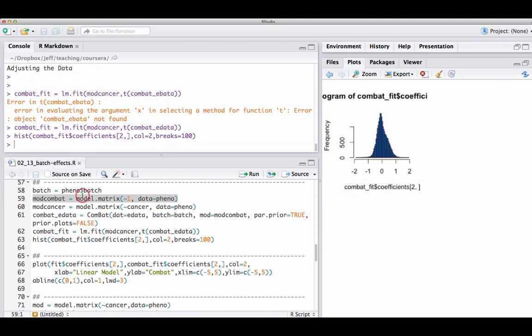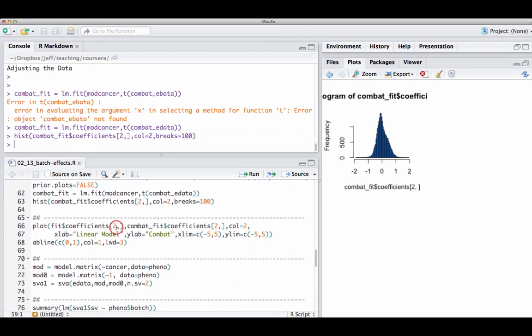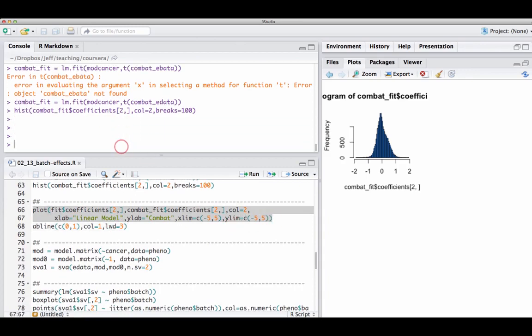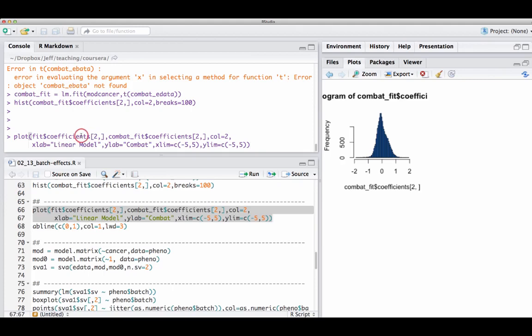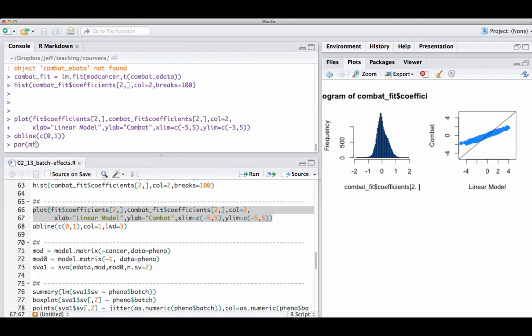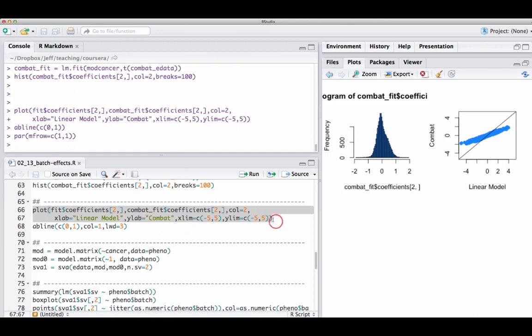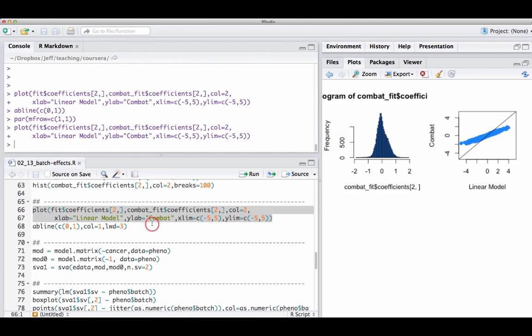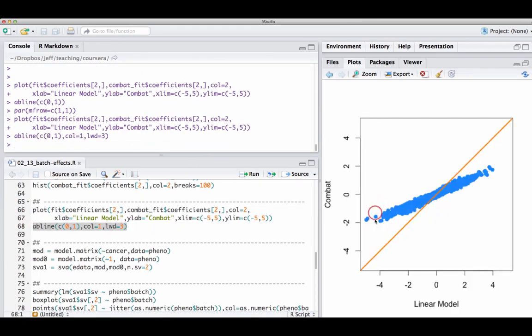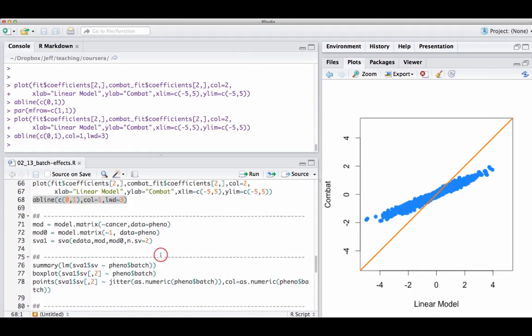The ComBat coefficients appear a little bit smaller than the coefficients from the direct linear adjustment, and that tends to be the case due to the shrinkage. I'm going to make a plot comparing the coefficients from the original linear model fit versus the ComBat model fit, and add the 45-degree line. You can see that the ComBat values on the Y axis are a little bit smaller than the X axis values, because of that shrinkage.